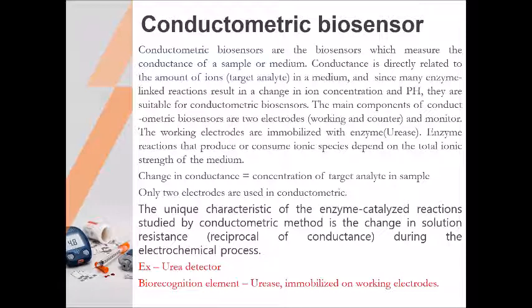The main components of the conductometric biosensor are two electrodes, namely working and counter electrode, and the monitor. And the working electrode is immobilized with an enzyme, namely urease.